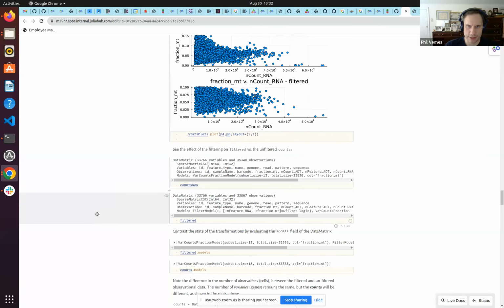It's also interesting, because as I mentioned, when you filter, you're going to possibly remove stuff, and that actually happens. So in this case, what we're specifically changing, we don't change the number of genes, but guess what? We do lose cells, right?